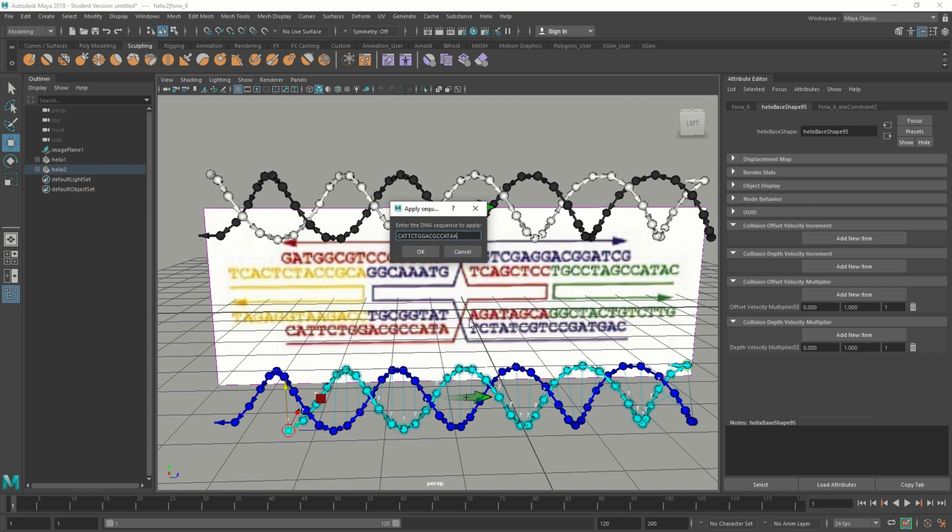If I mess this up, it doesn't matter that much. It's just an example. So GTC.